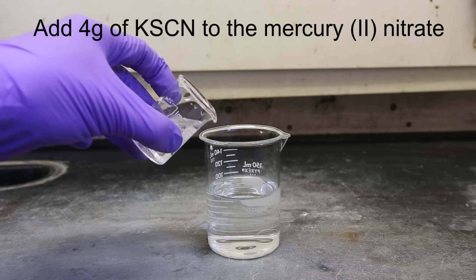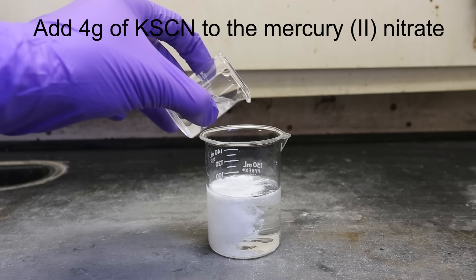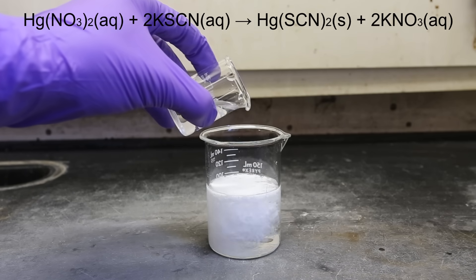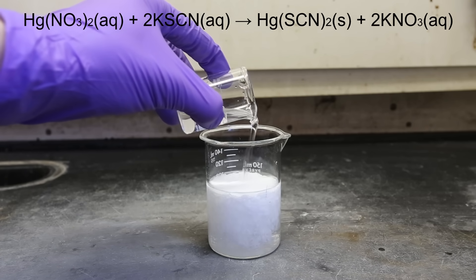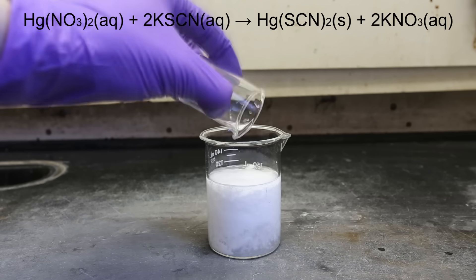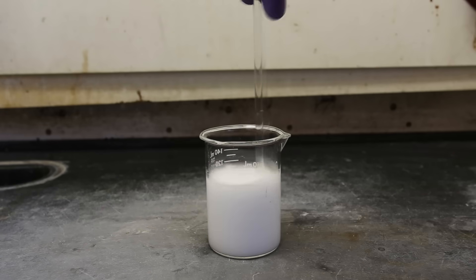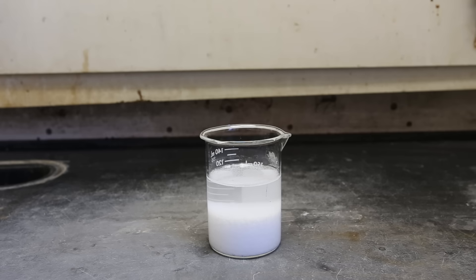Next, add about 4 grams of potassium thiocyanate — roughly weigh it out and dissolve in as much water as needed. The amount of potassium thiocyanate added is in slight excess to ensure that all of the mercury(II) nitrate is consumed. The mercury thiocyanate is extremely insoluble in water and will precipitate out, while any excess potassium thiocyanate will remain in solution. Stir the solution a bit and then let it settle — the mercury thiocyanate is considerably more dense than water and will sink rather quickly, within about 10 minutes.